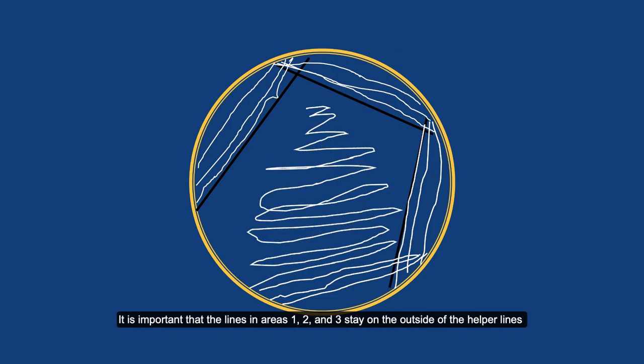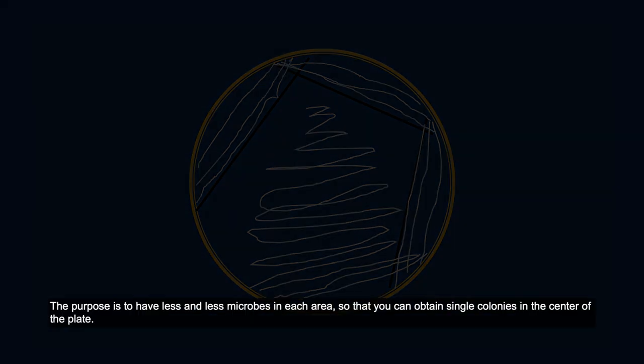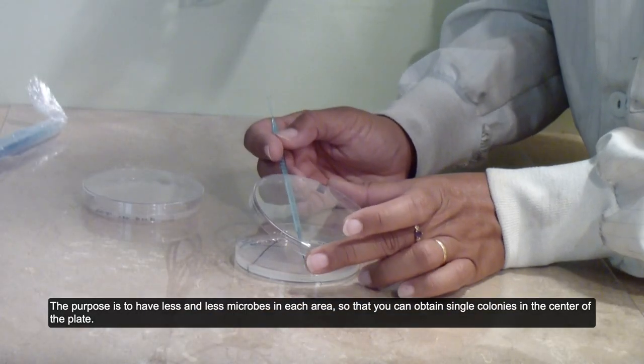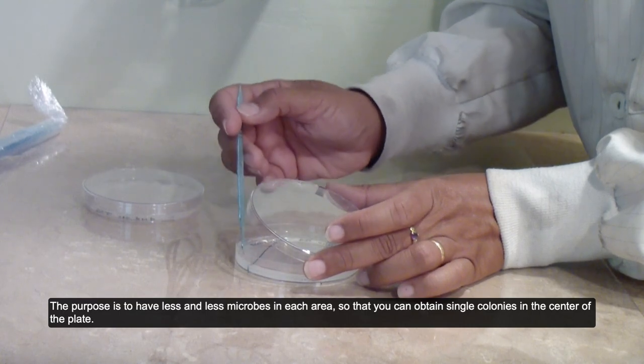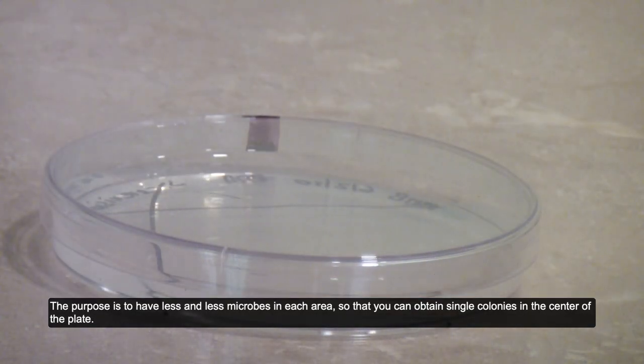It is important that the lines in areas one, two, and three stay on the outside of the helper lines you drew on the plate, and that area four stays on the inside. The purpose is to have less and less microbes in each area so that you can obtain single colonies in the center of the plate.